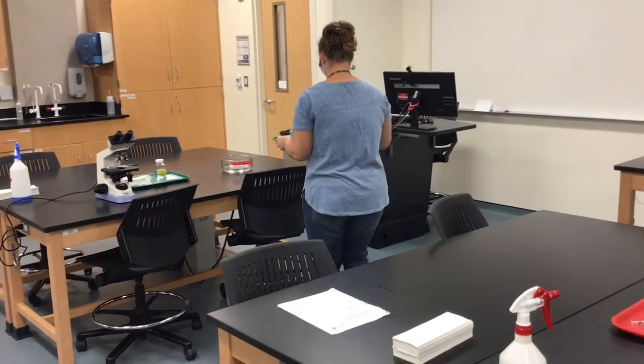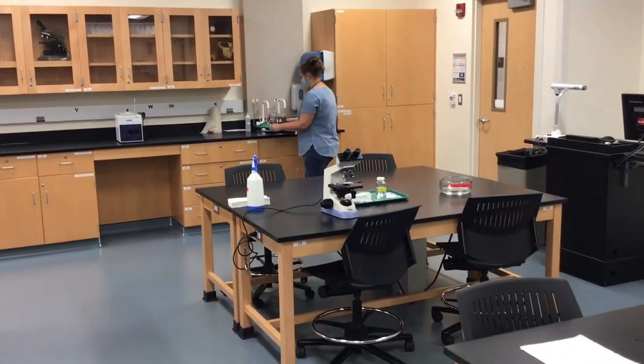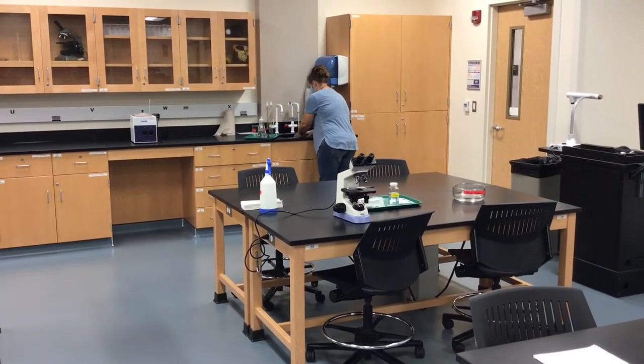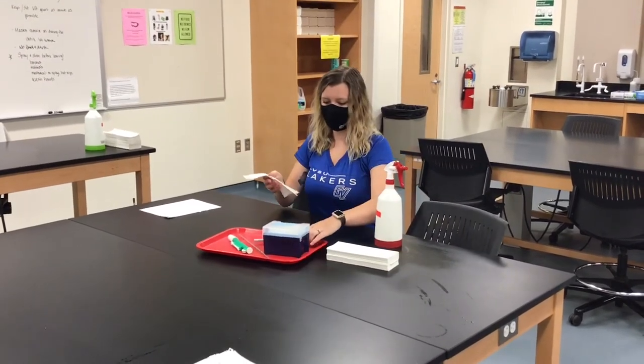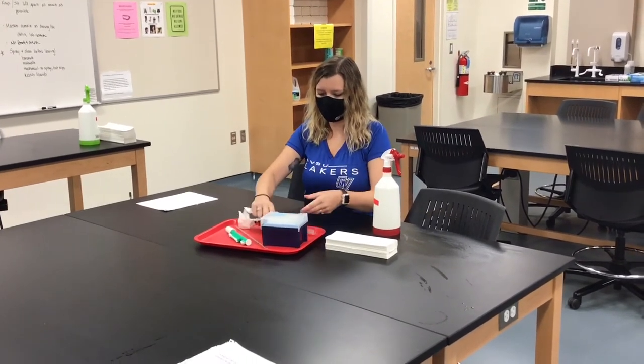Once the lab is over, you must clean and sanitize your workstation. Any non-equipment items such as beakers, flasks, and tubes can be washed in the sink with soap and water. Any equipment with internal components or that is electric can be wiped down with a paper towel and ethanol — this cannot be sprayed directly.